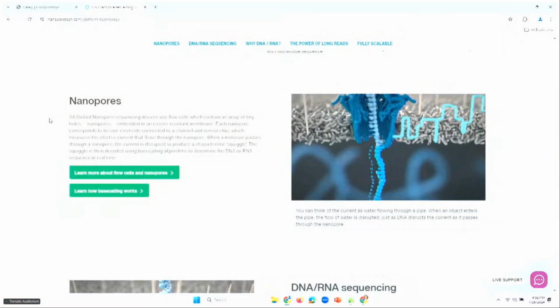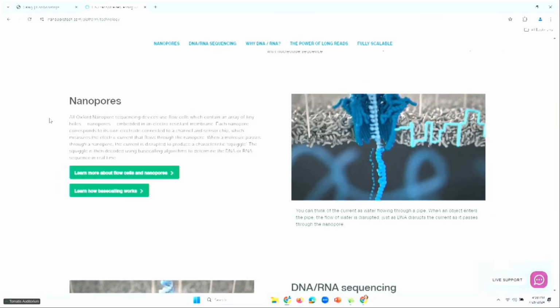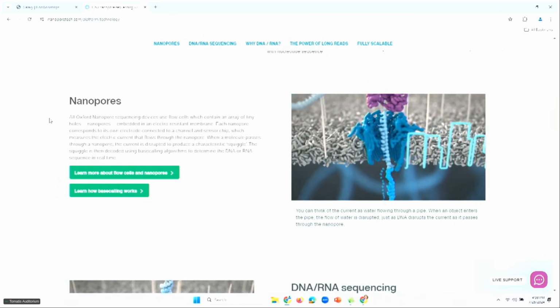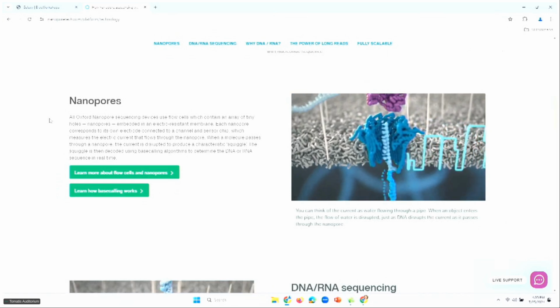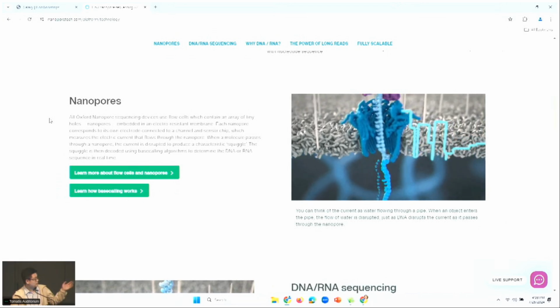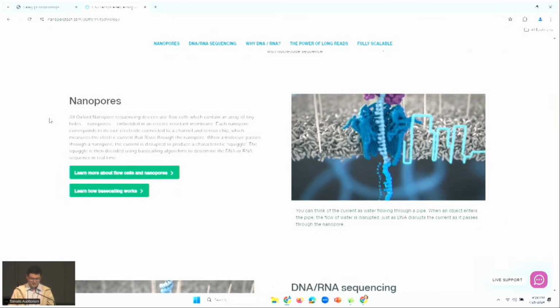So in the interest of time, I don't want to go too deep into all the things about methylation. Hopefully those who are in this workshop know a bit about what DNA methylation is, what it does, and why it's interesting. What I just want to introduce is the technology that my lab and many people around the world are currently using to analyze DNA methylation, and that's the Oxford Nanopore sequencing. I'm not paid by them, I swear.